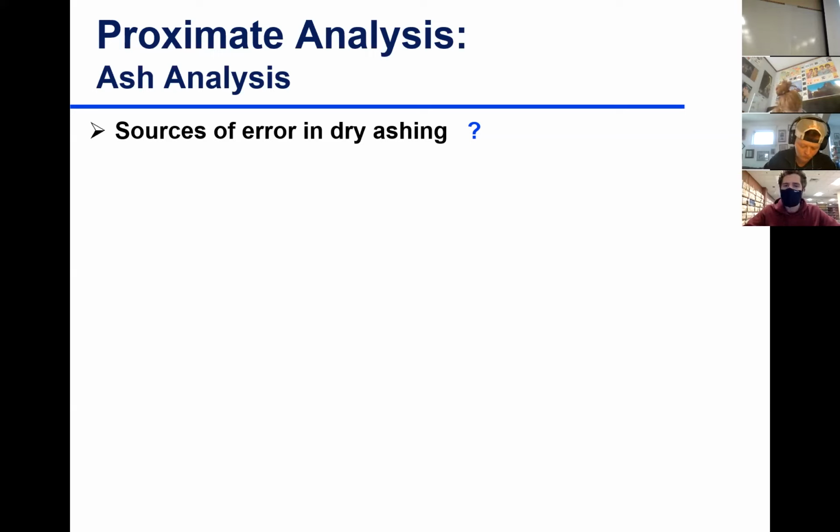Foaming over in the oven, yes, that's why we want to make sure of sample handling. Depending on the sample we have, we pre-dry it, defat it, or put it on a hot plate at lower temperature than would be in the muffle furnace to gently get rid of the foaming and also the burning and the smoke.